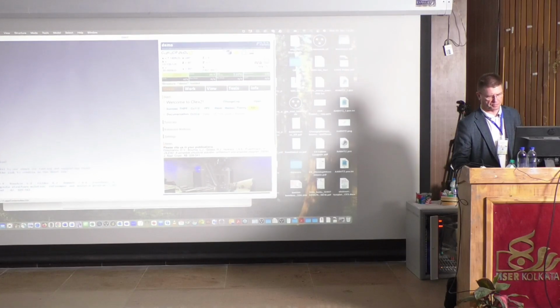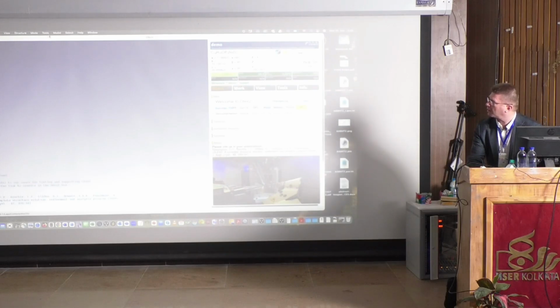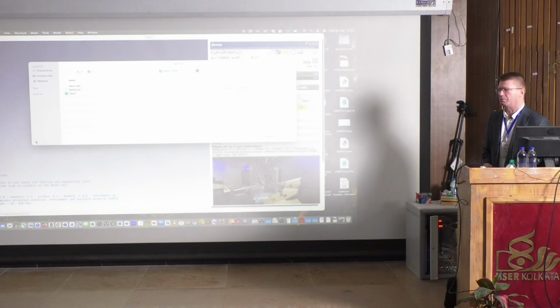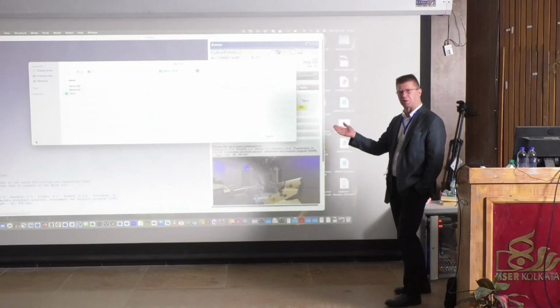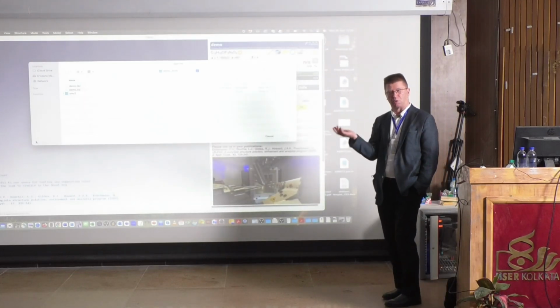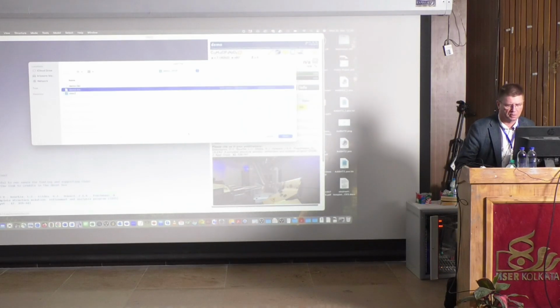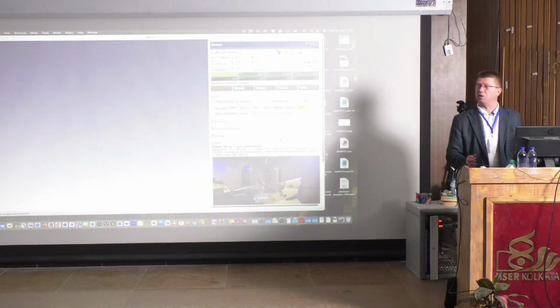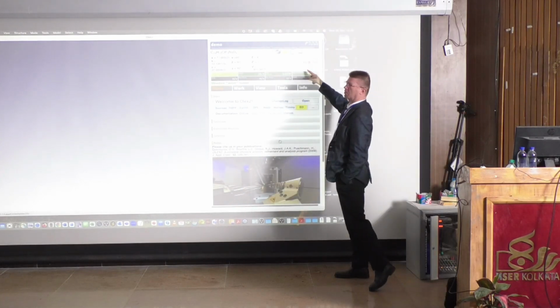And now, this is the thing. So you see how it is. What we do now, and don't worry about this, the Mac device is different, but here we have the open file. And here it remembers because I was checking this. There we have the two files. So there's the data file and then the index file, which is the same as you saw before. So what I will do is go in here and say open. And now it reads in the data. The data is there, and now you can see there is no information yet because we haven't done anything.